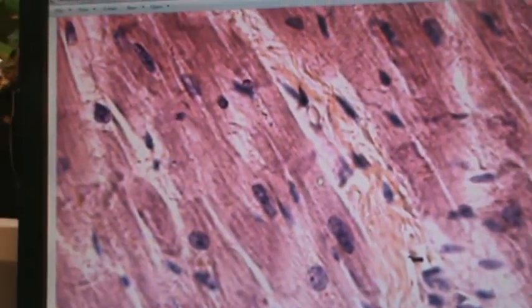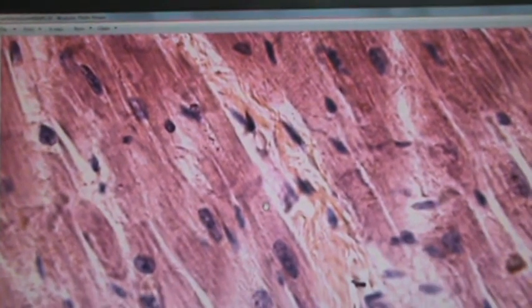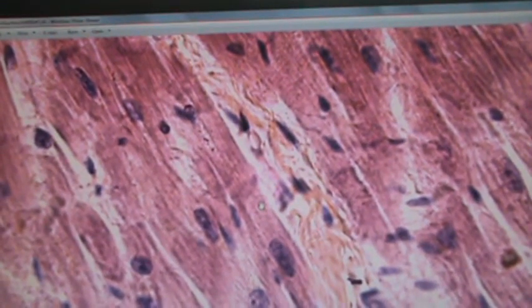It always is. It seems like they doctor it oftentimes when you see them in books. But this is what it really looks like when you actually look at the tissue. And you have to use your imagination a little bit. It's kind of branched, is one thing. You don't really see a lot of striation, but it does have some striation in the tissue. If you look, there are some very specific little cross-hatching that we have up on top. And simultaneously, we have these things called intercalated discs, which form these little lines. Let me show you one. So again, right there, you can see a little line going across there.